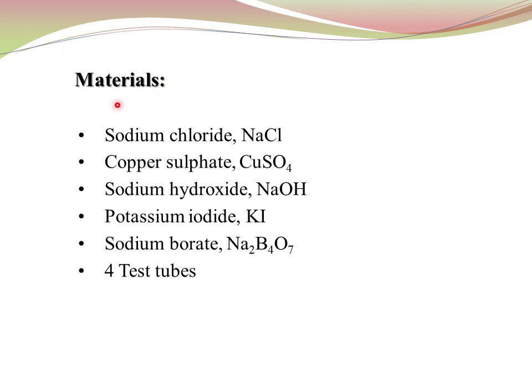The materials: sodium chloride NaCl, this is soluble. Copper sulfate CuSO4, also soluble. Sodium hydroxide NaOH, also soluble. Potassium iodide KI, also soluble. And also sodium borate Na2B4O7, soluble. And 4 test tubes.